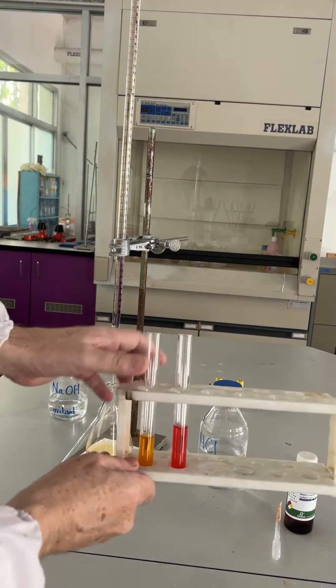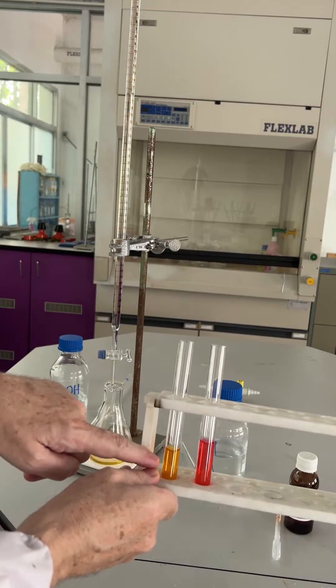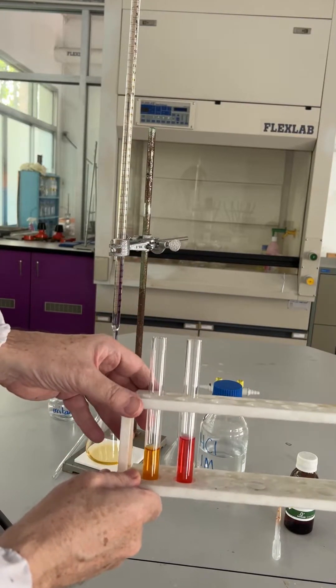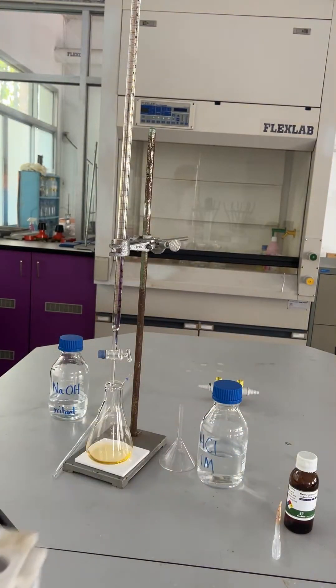And we can see the two colors the indicator shows - acid on the right here. We need to titrate to a mid color between the two, which is an orange color.